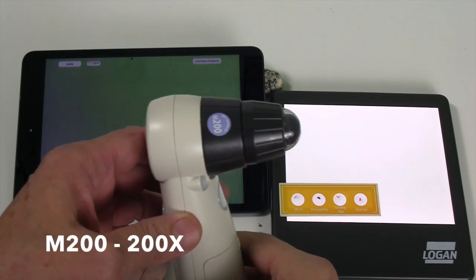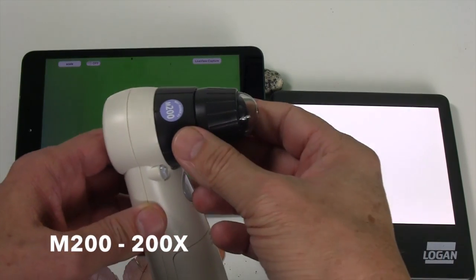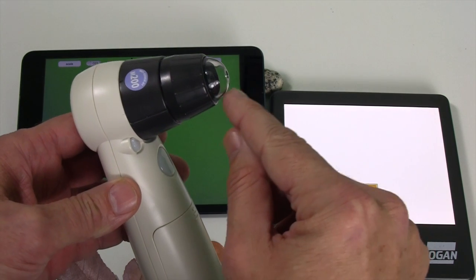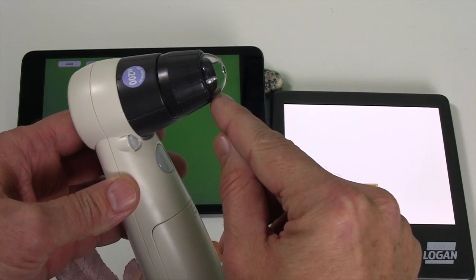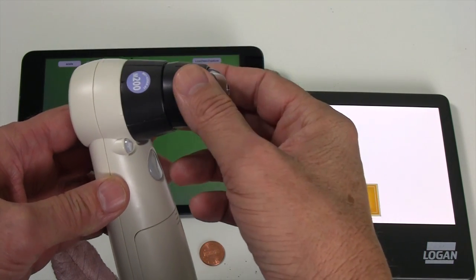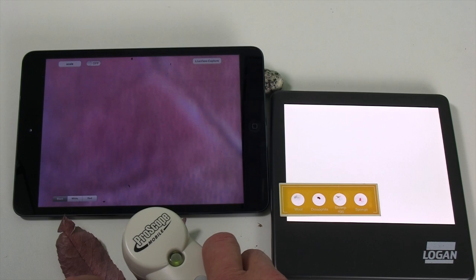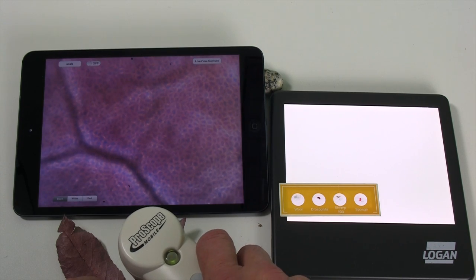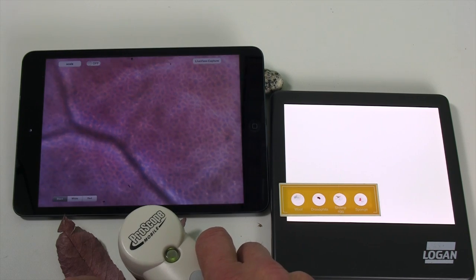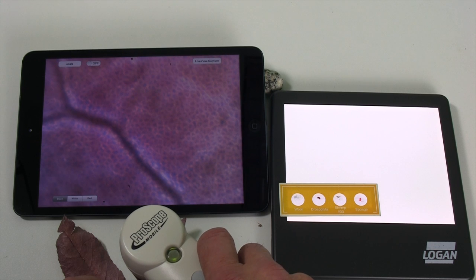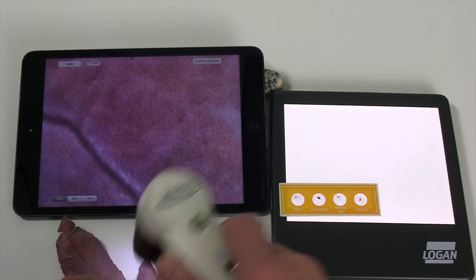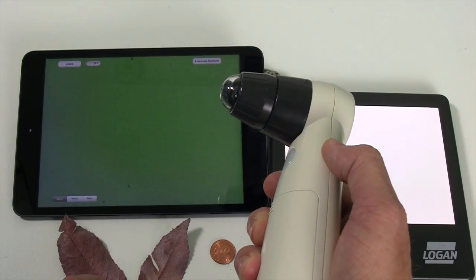This is the 200 power lens. Like the 100 power, it has a clear globe at the end, and it has the focus ring right here. And you can actually see the cell structure in there, those individual cells, quite easily. And I'm using this reflective view right now.